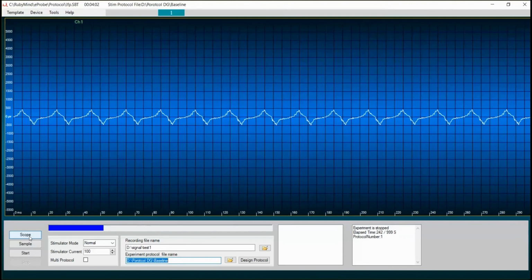There's another button at the end named Trigger. If I make it on, the scope stays fixed, and if I make it off, it will continue its moving. You will know this more when teaching the Stimulator. For now, we make it off. I'll close this window and we'll go to the window below.